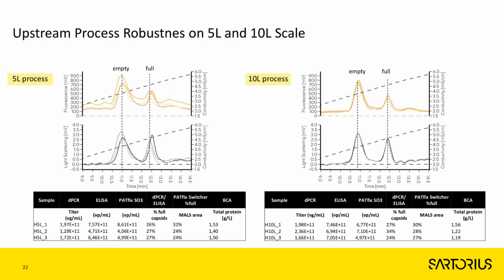It is also very helpful to have the visual on how these empty and full peaks look like on chromatography, because this is at the end going to be your main downstream tool to capture and polish AAV. So with this kind of information, we approached our downstream team who processed the material as shown before. So using Simultus SO3 as a capture and then Simultus QA-HR as polishing.